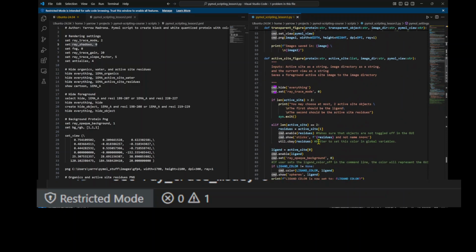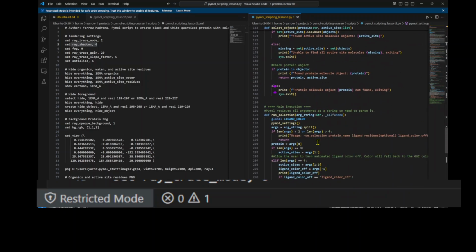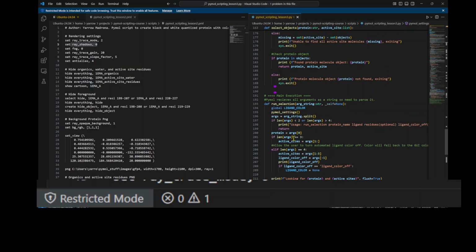So I'm going to go down a little further so you can see the organization. Usually in a Python script, there's a main function you call. It's actually usually called main, an if __name__ == main function. Usually if you run your script, this will automatically call that function, which will call everything else that you need.